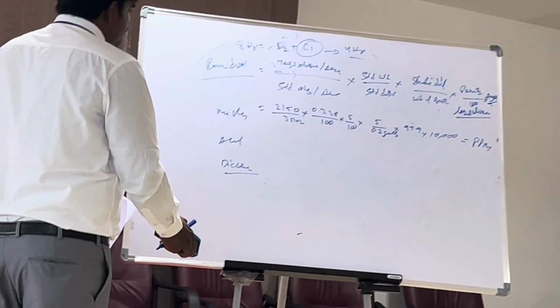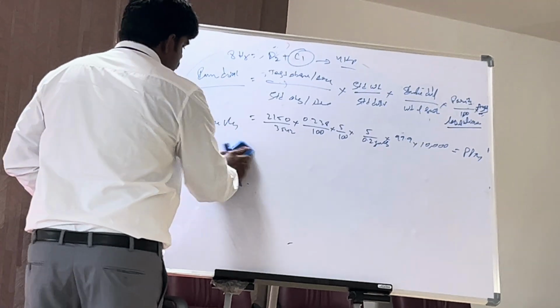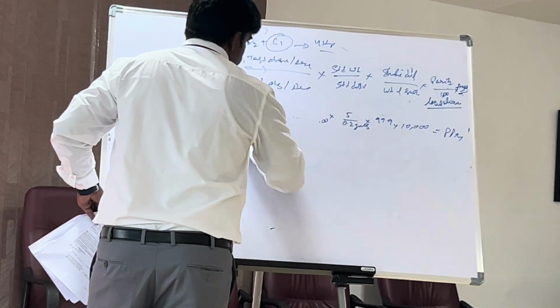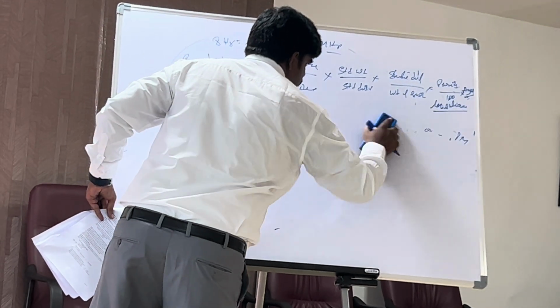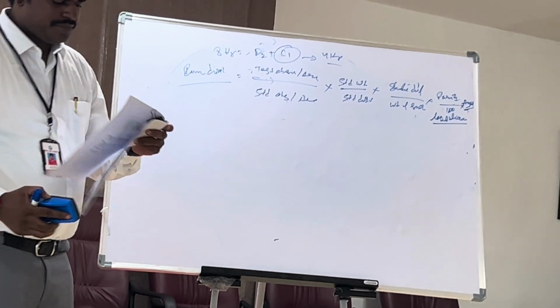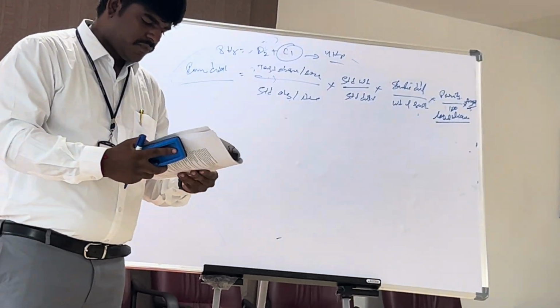Area normalization technique means what?